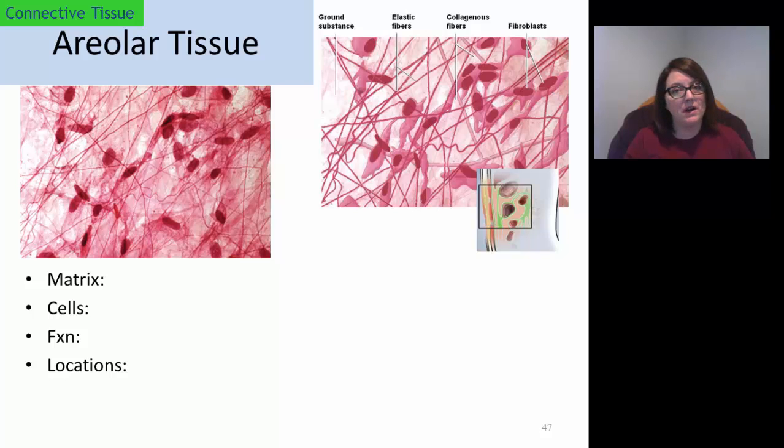Hello, in this video I'm going to show you some examples of connective tissues found in the human body. Hopefully you already watched my video on the introduction to connective tissues, which talks about the importance of the matrix of a connective tissue.